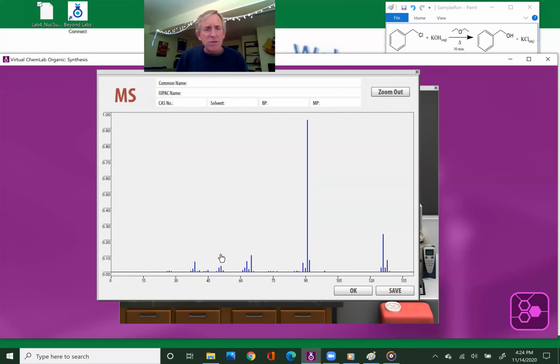How do I know it's benzyl chloride? Because I already did due diligence. I already looked up benzyl chloride's molar masses, and I knew that it had chlorine in the 3-to-1 ratio, and I knew it should be at 126 and 128. Then I take my cursor and move it over the peaks, and it labels them for me. Notice there's 126, and it gives the relative abundance.